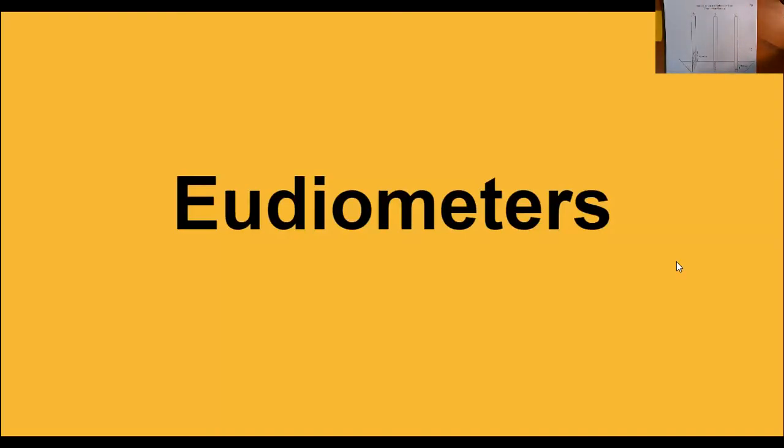Hello, students. What this begins is a lesson on what we just generically call eudiometers. They could also be called gas collecting vessels or gas collecting tubes. This video will allow us to learn what a eudiometer is and how we utilize it in chemistry. So, just to give some overview.